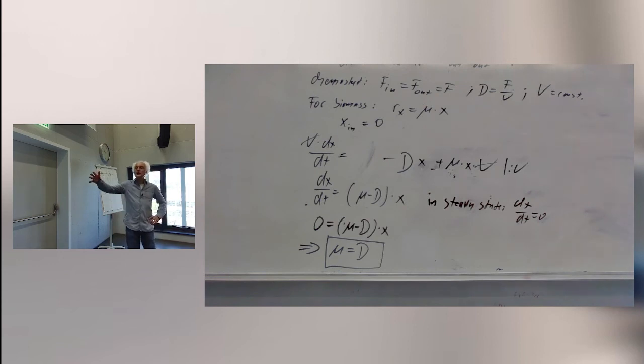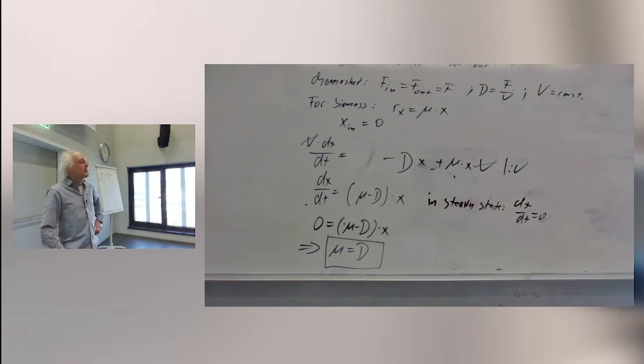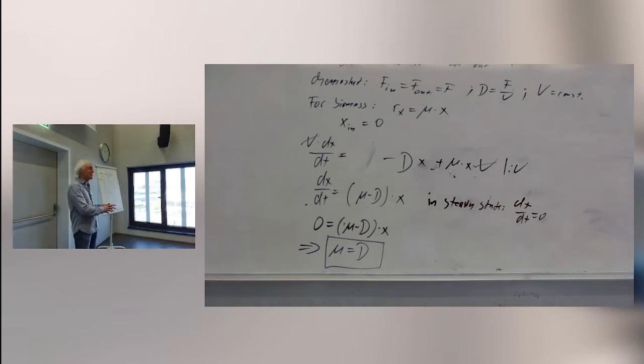Now, can I change the dilution rate to whatever value I want? Technically, yes, if I have a large pump. But you can also reduce the volume? I can, but by definition of a chemostat I pump the same in as out, so I would not reduce my volume.